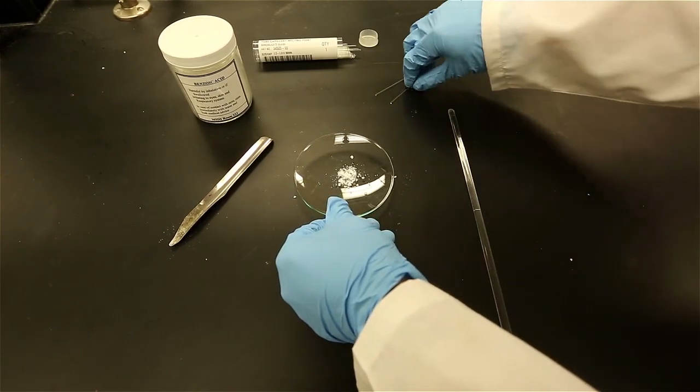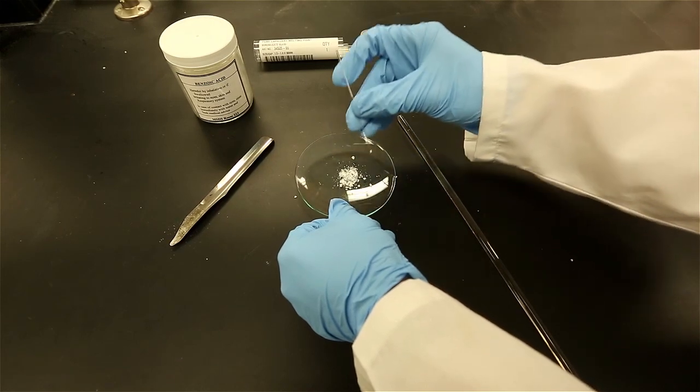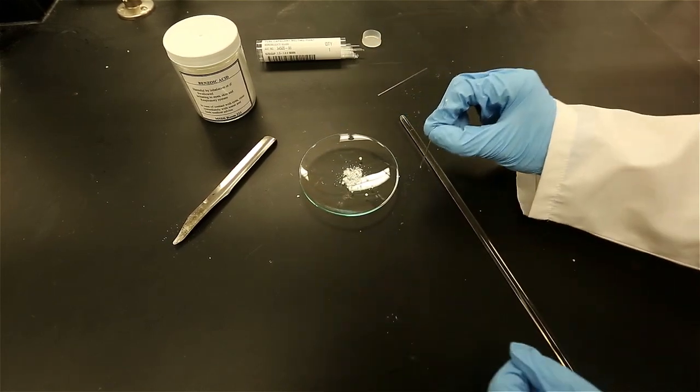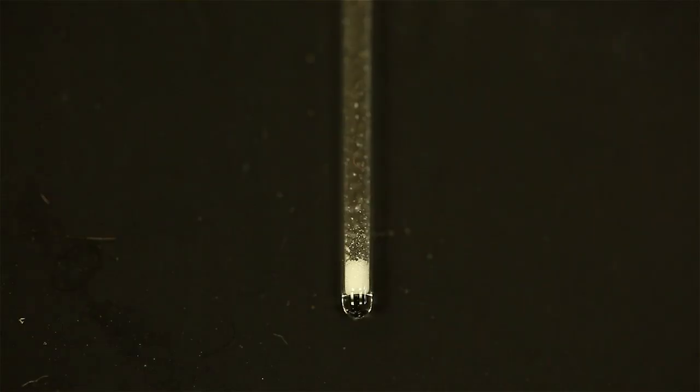Once the sample is relatively fine, use the capillary tube to tap the open end of the tube onto the sample. Once a small amount of sample has entered the tube, tap the closed end against the bench to allow the sample to fall to the bottom. The goal is to fill approximately 1-2mm of sample into the tube.